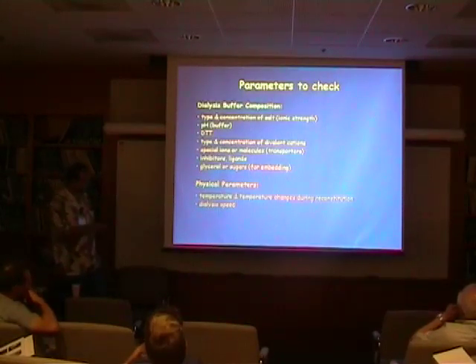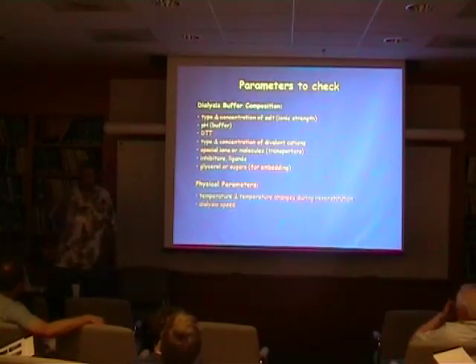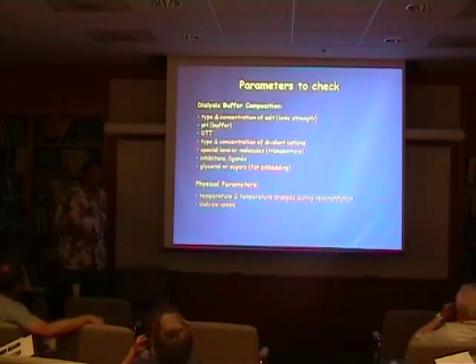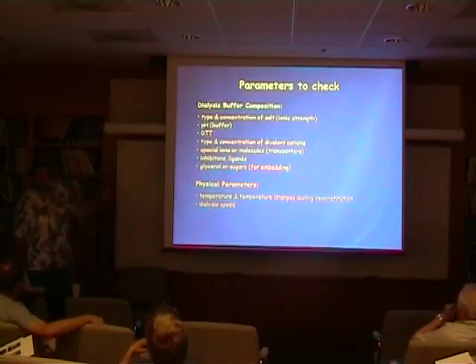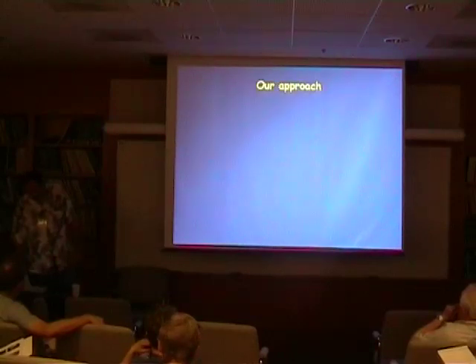And so that's something that we have tried recently: to dialyze a reconstitution mixture against the buffer where the detergent is at its CMC, and what we got are bigger crystals. So it seems to make a difference, but it certainly needs much more experiments. And so these are all different parameters that you can check, and you can basically come up with as many more as you want.